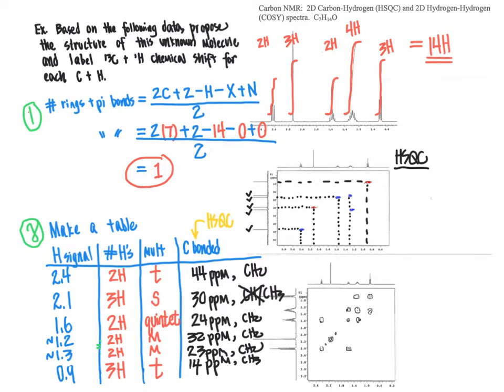Whenever I see methyl groups, CH3 groups, those methyl groups have to be at the ends of the molecule because they can only be bonded to one carbon atom. And so I like to work my way inward from there. And so I'm going to start trying to piece together some little parts and pieces of the molecule by looking at this 3 hydrogen signal right here that's a triplet and asking myself, how could I end up with a 3 hydrogen signal that's a triplet?